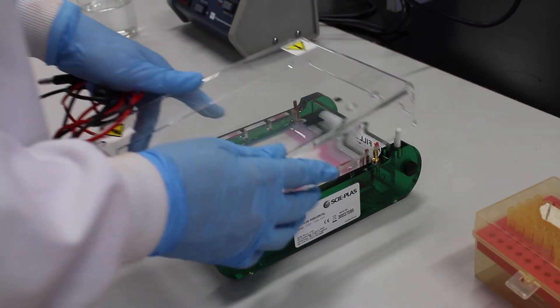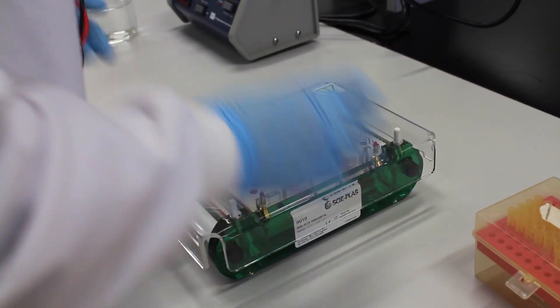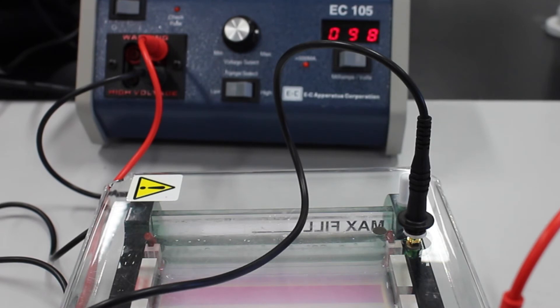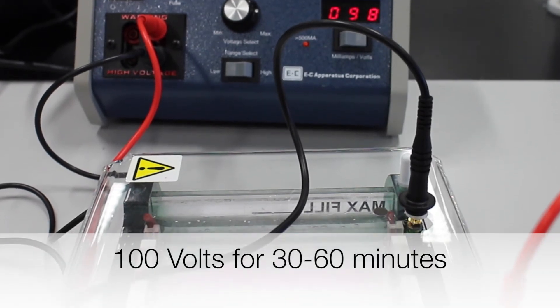The gel is now covered and the electrodes are applied. The gel is run at 100 volts for 30 to 60 minutes.